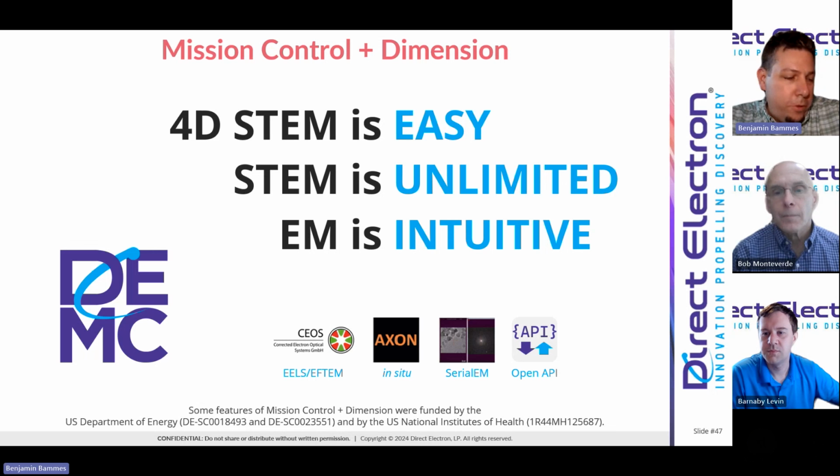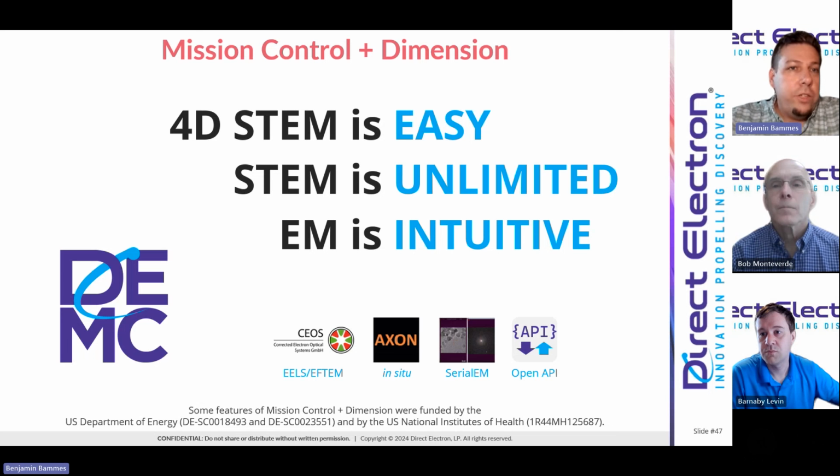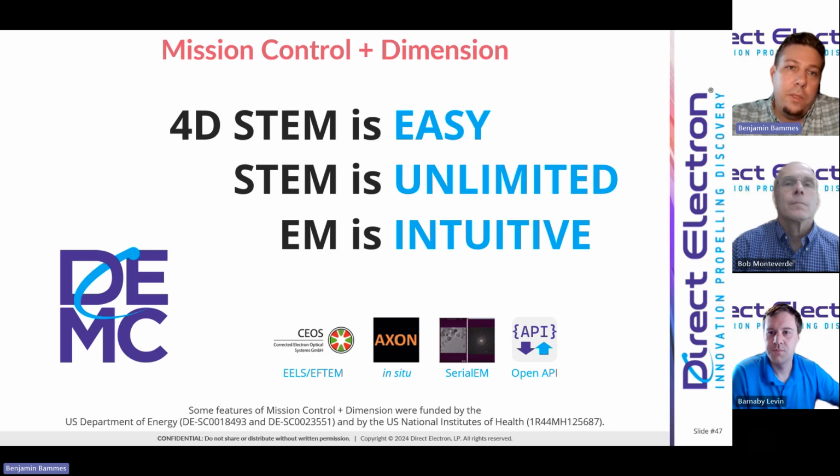Yeah, the shape of the virtual mask is really up to you. You could use wedges instead of full circles, for instance, things like that. You can calculate differences between different regions. It really is just up to the user in terms of how they decide to use their virtual detector. But we tried to build as much flexibility into it as possible, so that what you would like to do is possible.